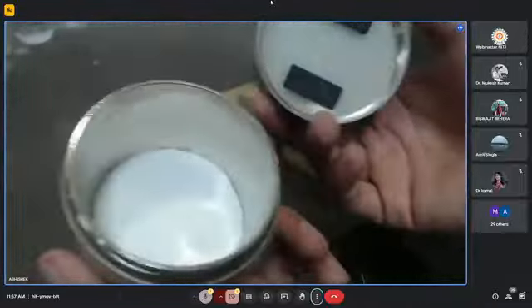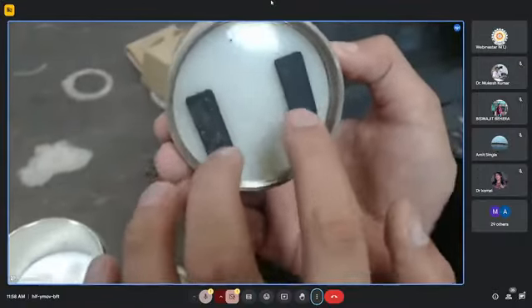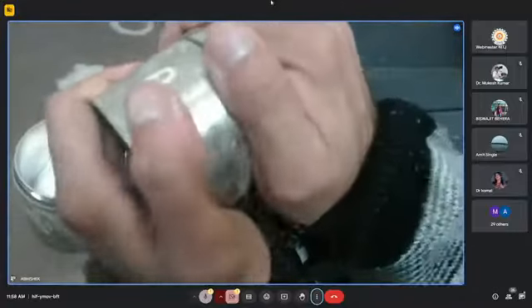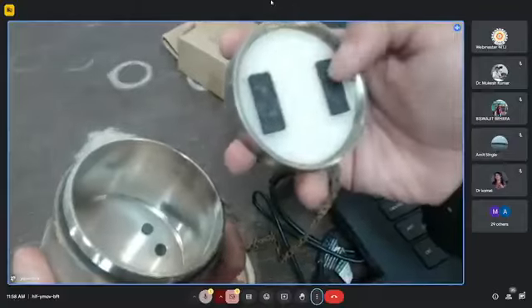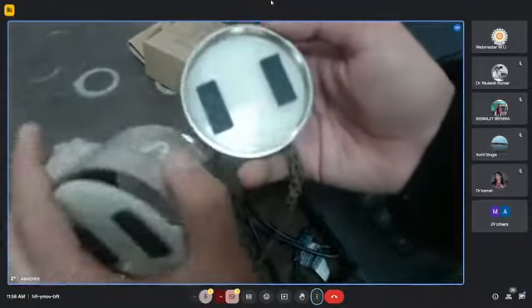This is the first chamber, called the radon plus thoron compartment, and you can see these are the two slip pins. Inside these two slip pins, our detector LR115 is placed, and when we open it from the top side, there is another chamber which is called the radon chamber, and again there are two slip pins. Between these two slip pins, another LR115 detector is placed.